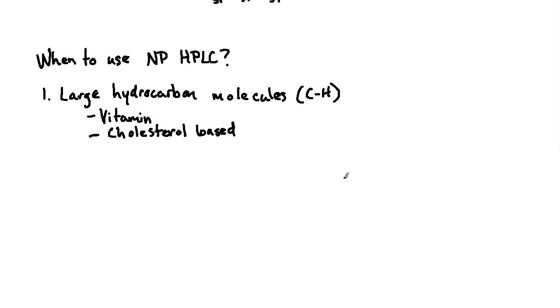So another situation which may seem extremely obvious, but is still something we want to mark here, is if reverse phase HPLC fails, okay? So if this is the case, usually what's going to happen, this is just reality here for a minute. Most people are going to go to reverse phase unless they have a very strong reason, like in example 1, and I'll give you another one, a third example here.